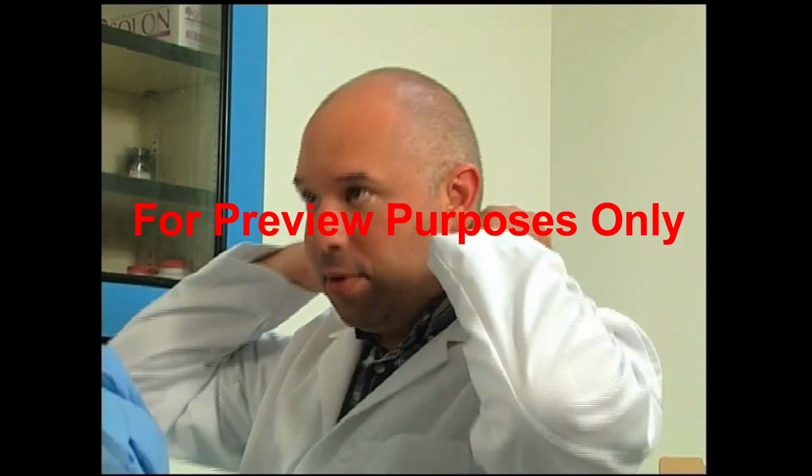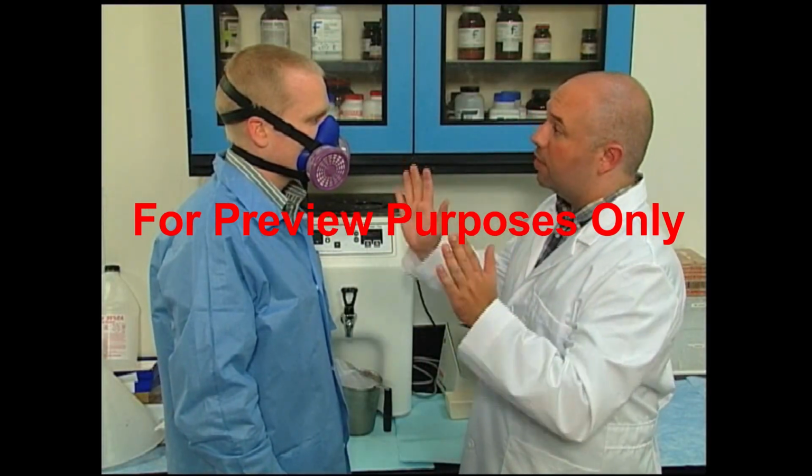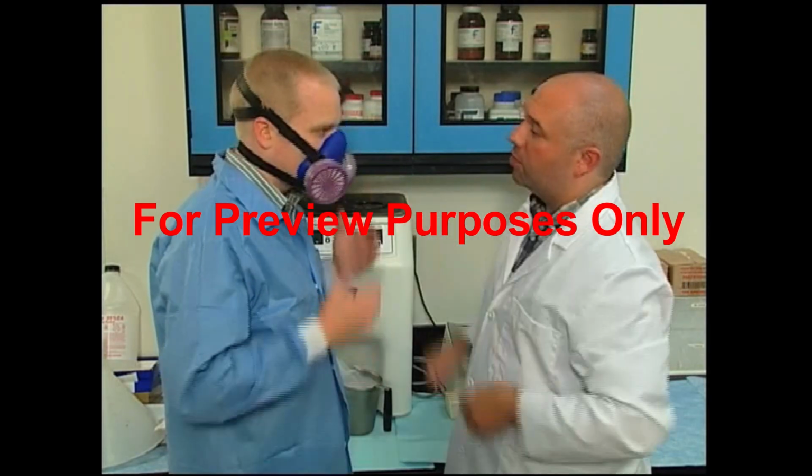It will discuss the proper selection, training, and fit testing of respirators, as well as how often the cartridges will need to be replaced.